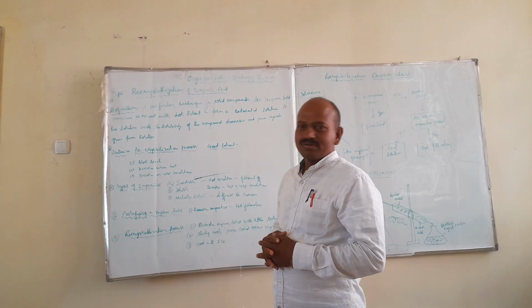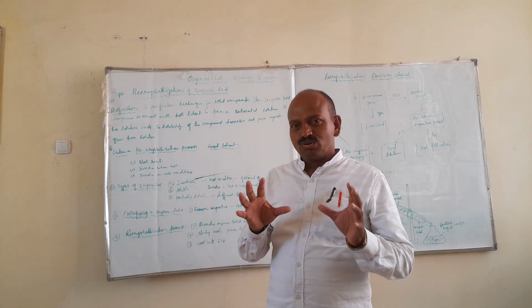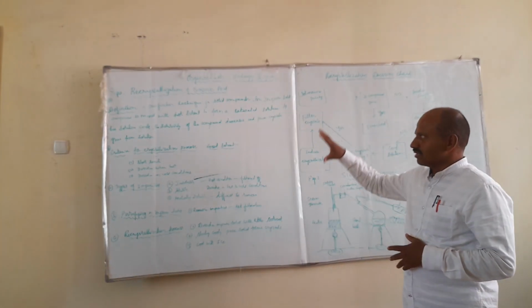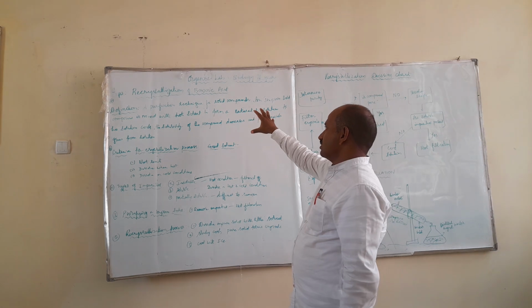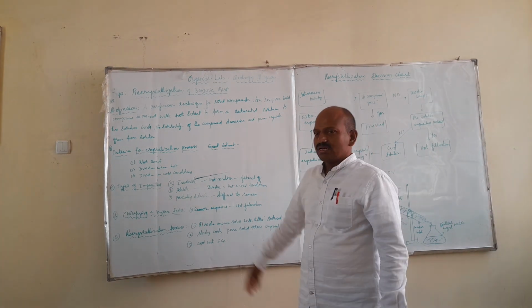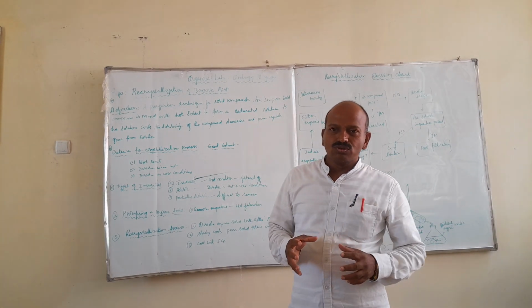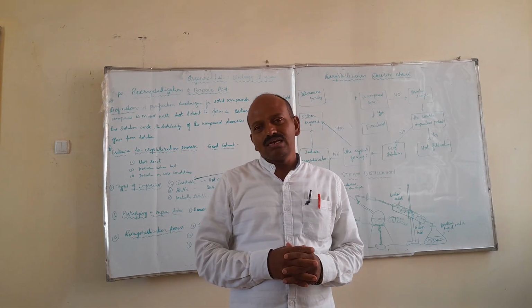So today we will discuss the organic chemistry laboratory, which includes the recrystallization process. Let us have an overview of the experiment, that is, recrystallization of benzoic acid. All organic compounds consist of some impurities. We should know the definition of recrystallization, but before that we should understand crystallization.